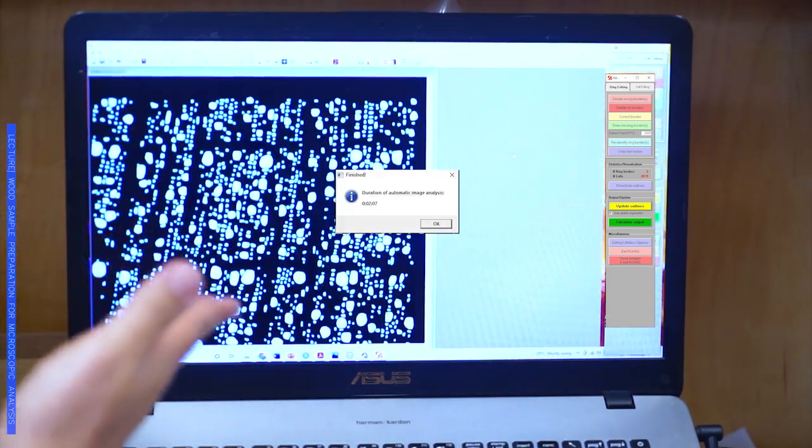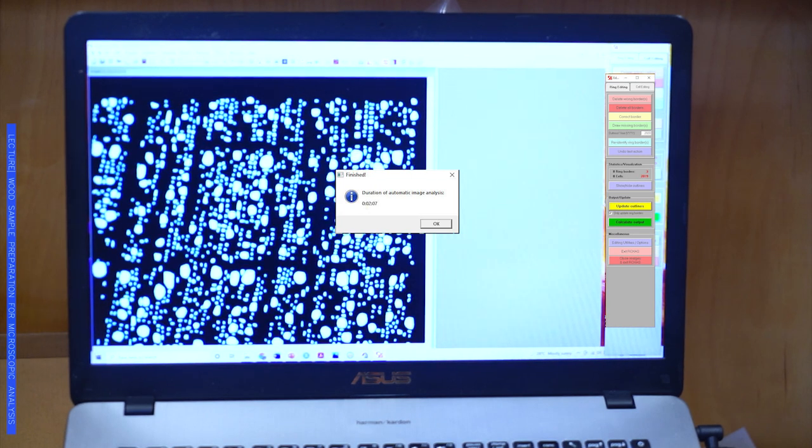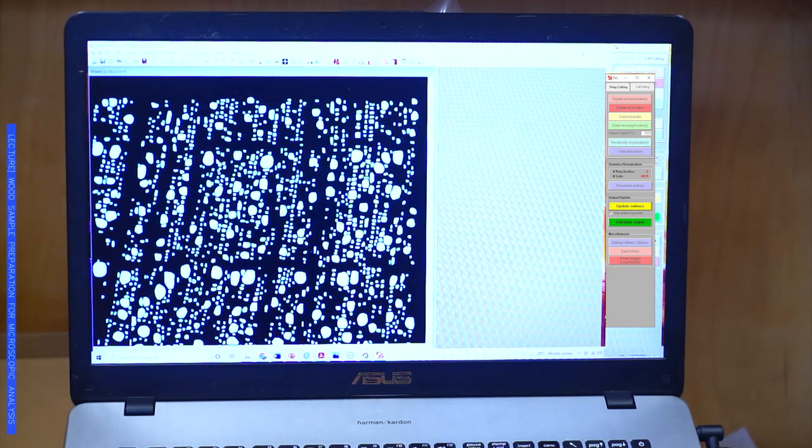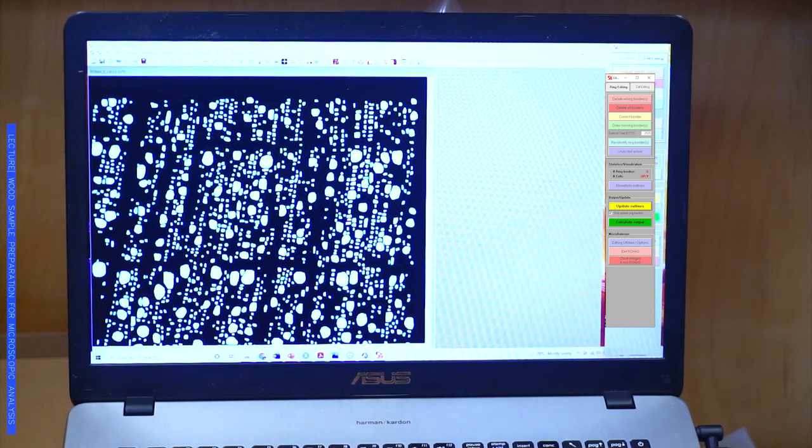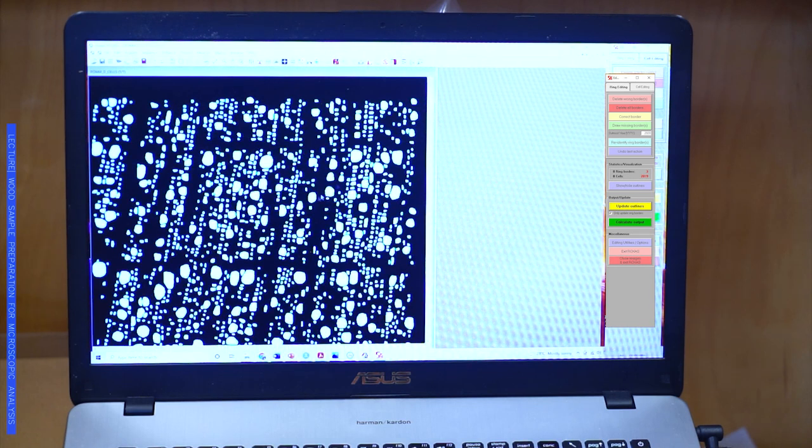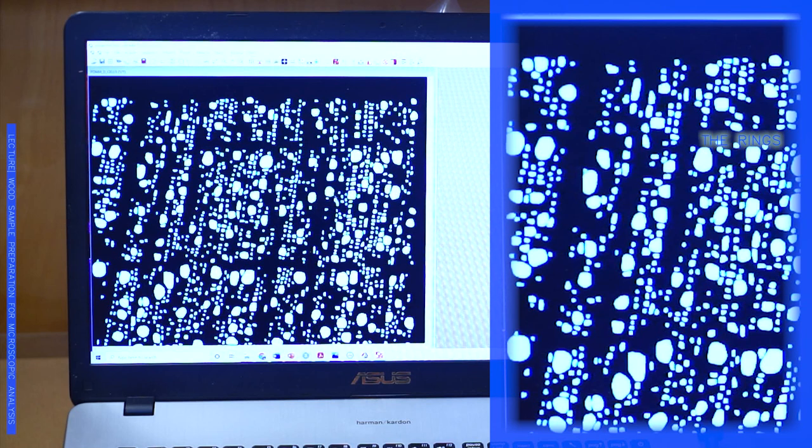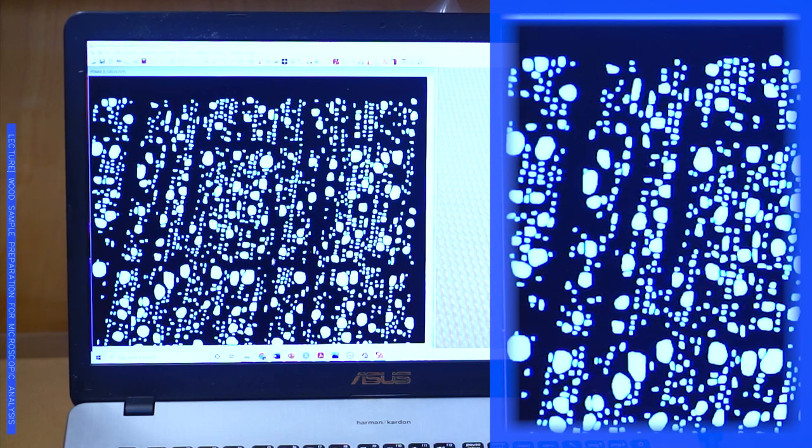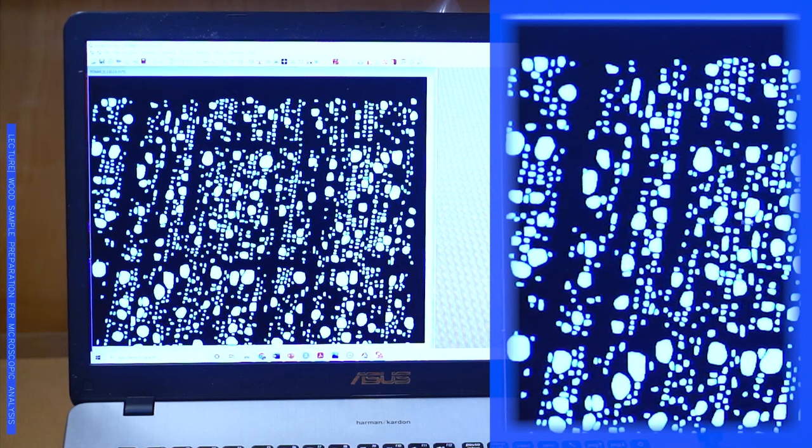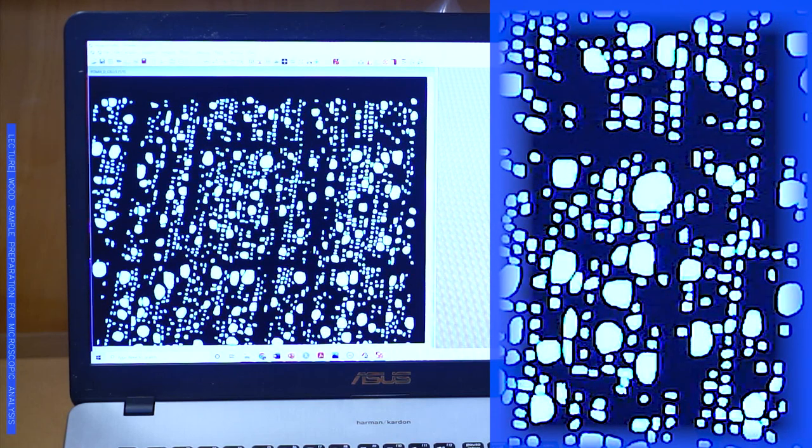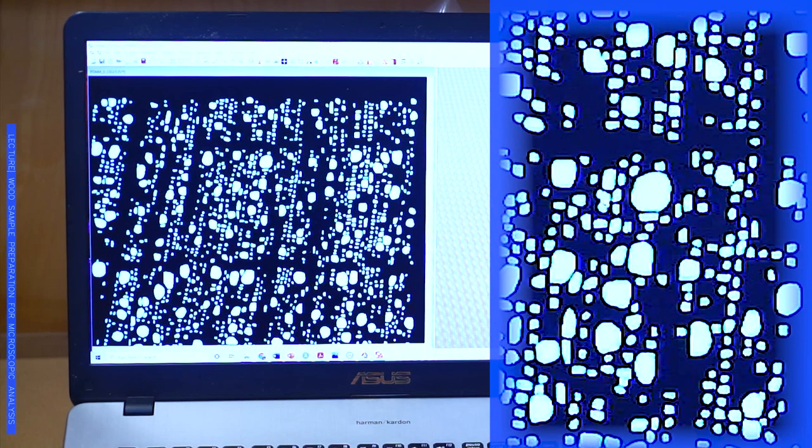In this case, just in two minutes since we started, we were able to get the analysis of the image. Here you can see the cells that the program has captured. If you are able, you will see these dark spots, those are the rings. And also vertically, there are some dark spots, those are the rays, which is an area that we do not want to measure. In this case, we are just measuring the cells that we are interested in, which are mostly the vessels, the biggest ones, and some of the small fibers.